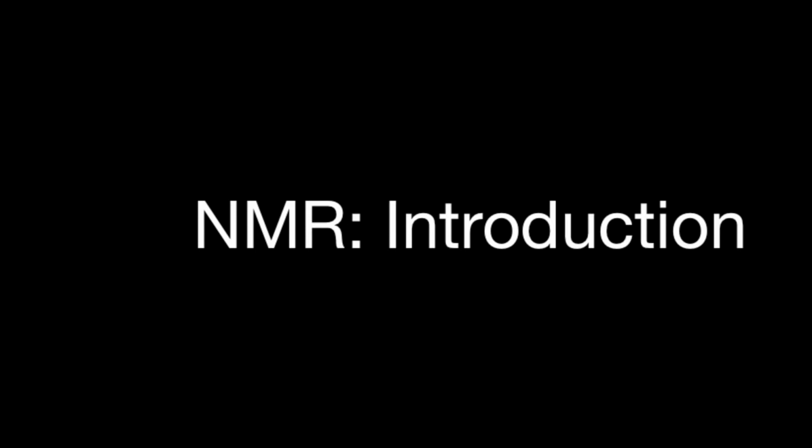For about the next 10 minutes, I'll be answering questions such as, what is NMR? Why do we need to learn it? What information does NMR give?